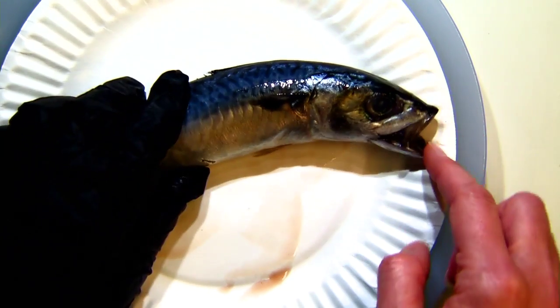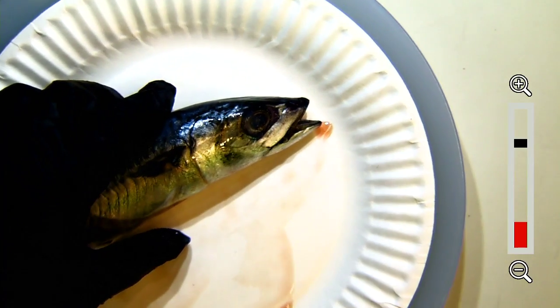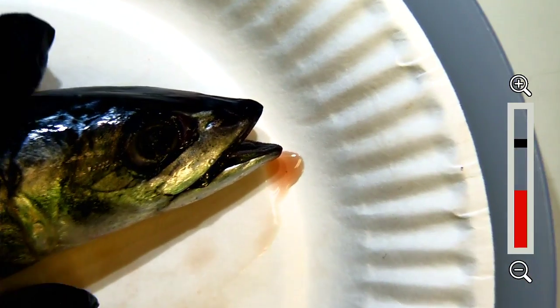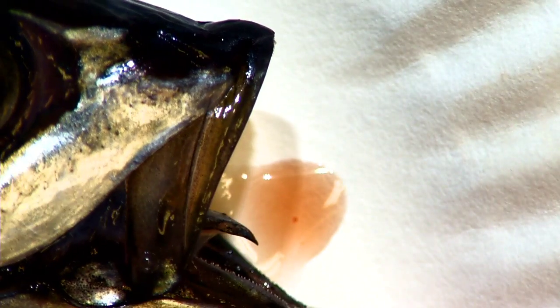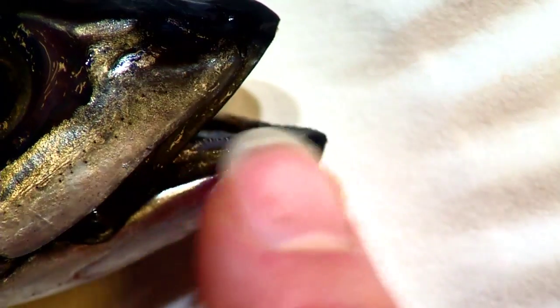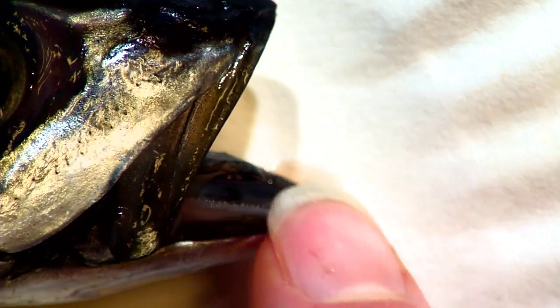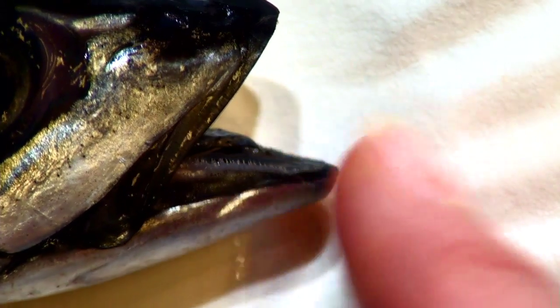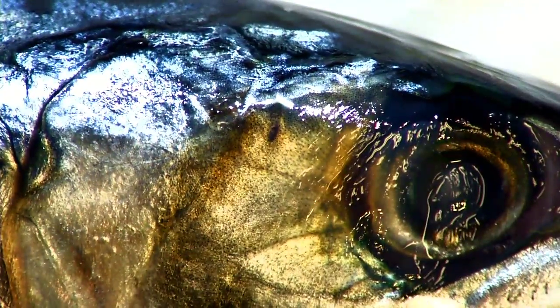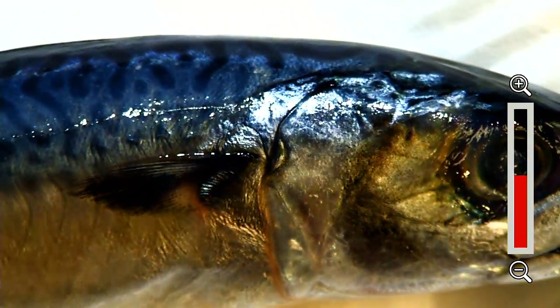So we've got the mouth and the tongue. Also in their mouths they have teeth - these little ridges, tiny teeth right here. They do have teeth for eating their food, whether it be small plankton or other small fish.